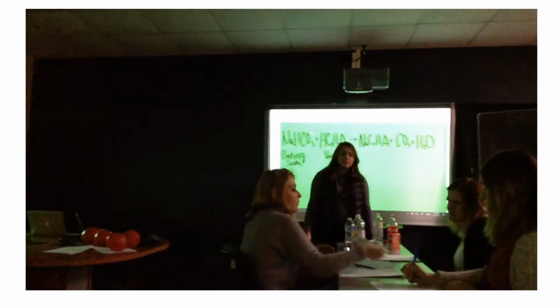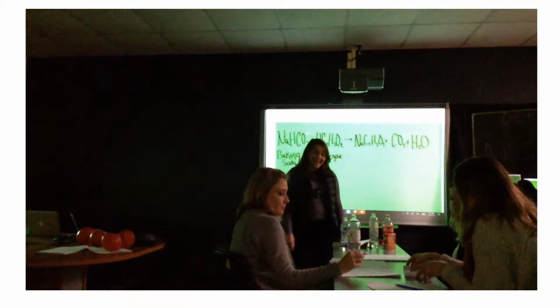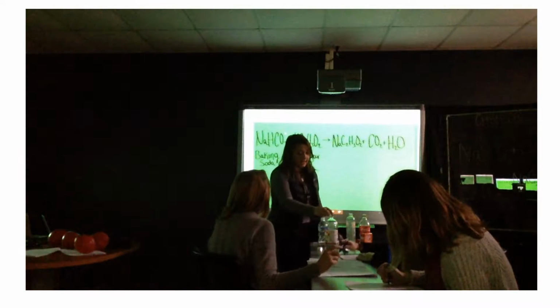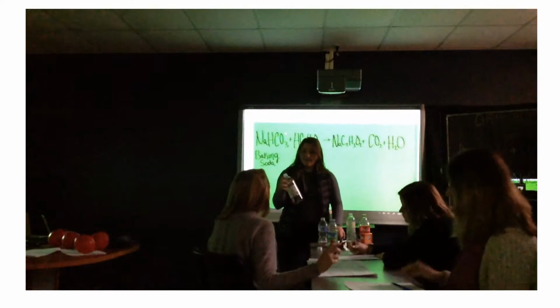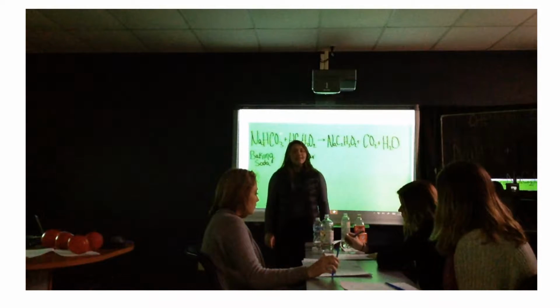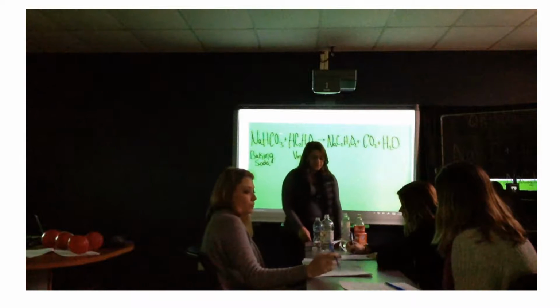It's white. I use it to make chocolate chip cookies. Yeah, perfect. Me too. It's a solid. Exactly. And another thing, a side note that you want to keep in the back of your brain for next class is here we have an acid, acetic acid, and here we have a base. And so when we mix an acid and a base, usually we get a pretty crazy reaction. And we're definitely going to get to see that today.